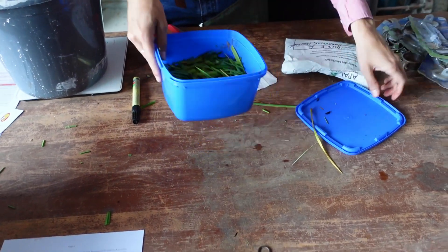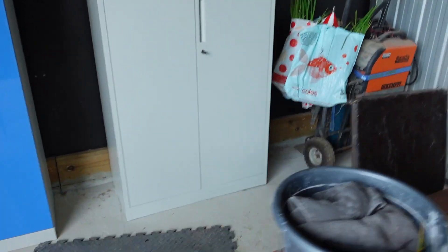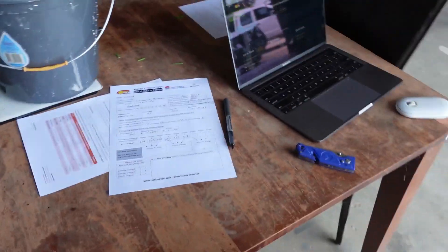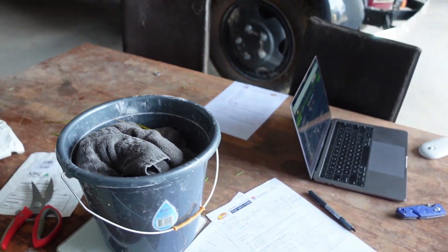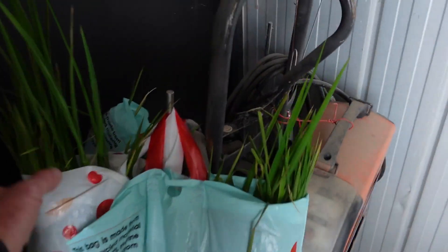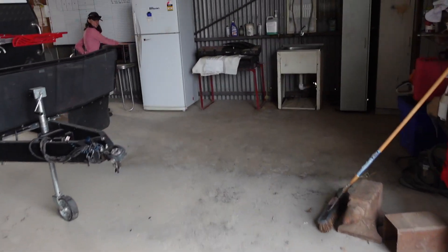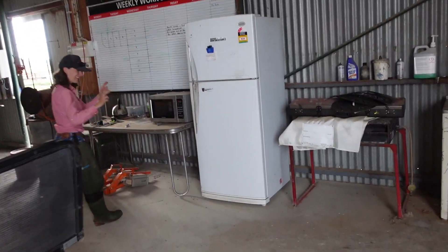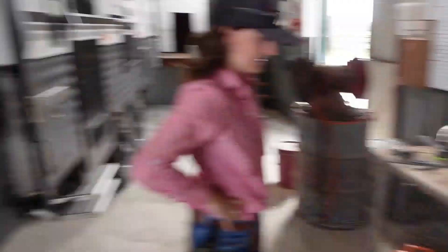We've weighed each individual sample and then Miranda's just taken a handful out of each of the six samples we've taken, with a bit left over. Then we've chopped it up into the ice cream dish and now we're using the microwave to dry it down.